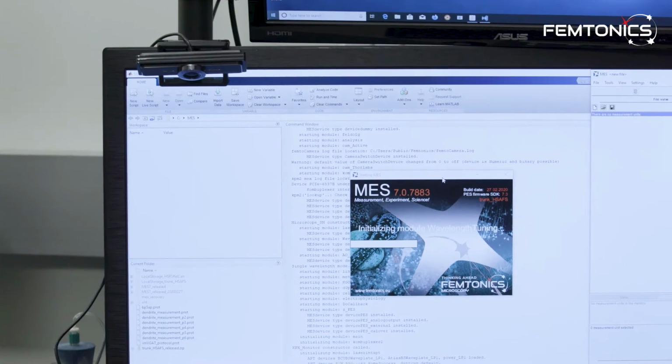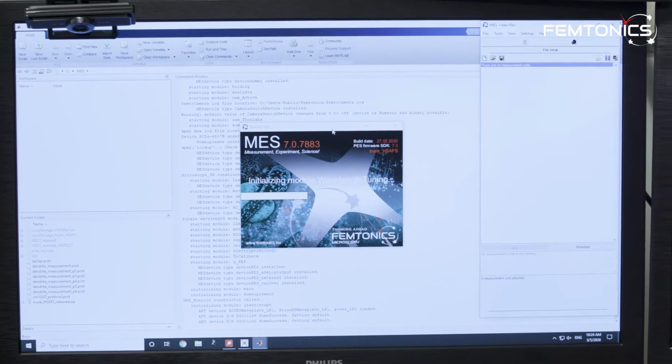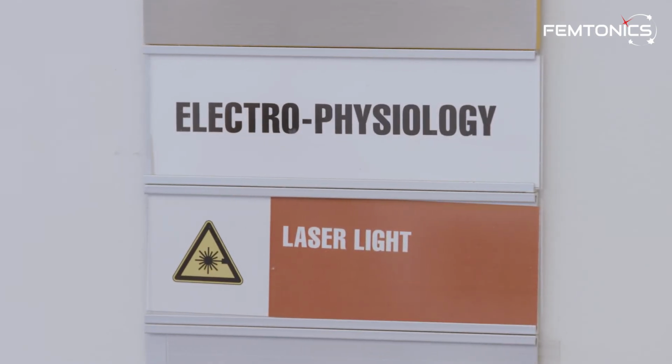So we are excited about the possibility to develop the system, and our system in particular here, in the direction where we can carry out targeted two-photon stimulation or inhibition of identified cells or populations of cells or even subcellular compartments, since that would be a major step forward compared to that large-scale optogenetic manipulation that indiscriminately activates, stimulates, or inhibits that neural circuit component.